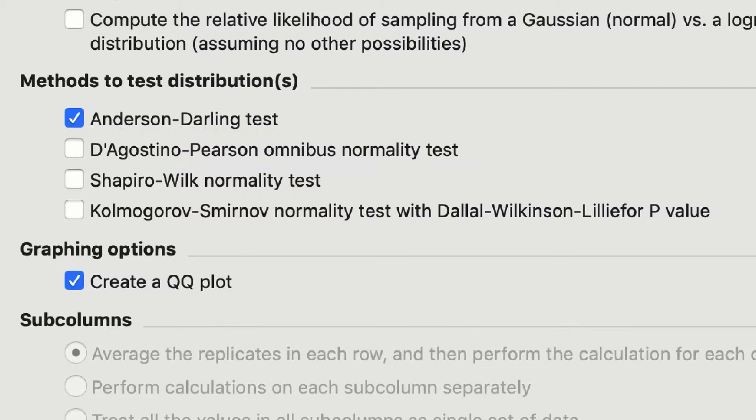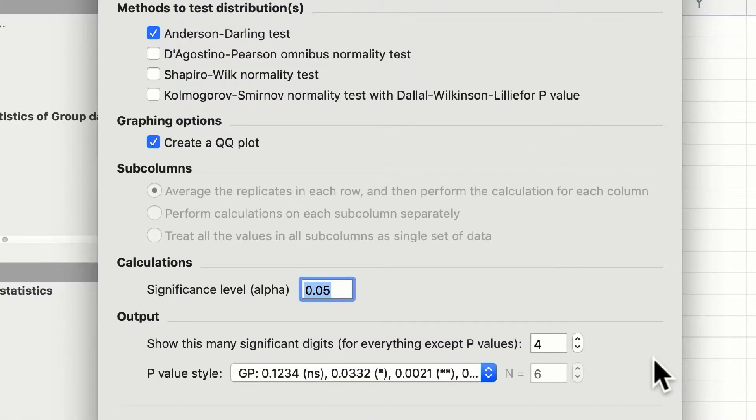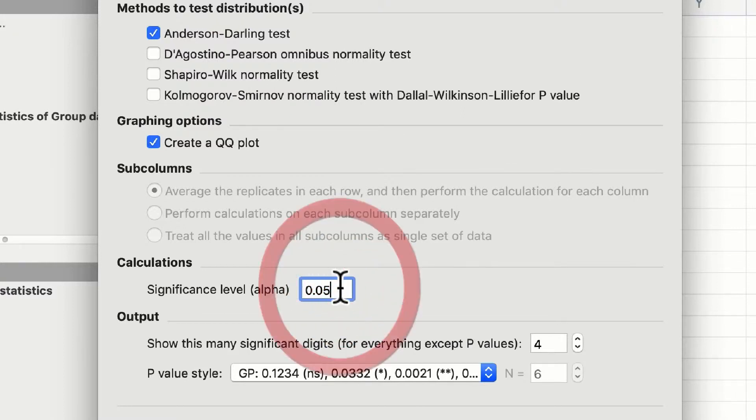If your p-value is less than 0.05, if you select your significance level, for instance here, and the alpha to 0.05, your data will not be normally distributed.